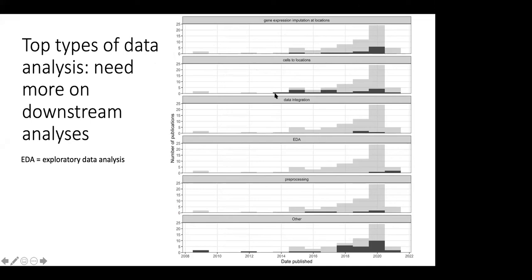Again, we see, consistent with the observations from how we're actually using the single-cell spatial technology, that the most popular ones are actually designed for integrating the spatial data with single-cell RNA-seq data. In some ways those are complementary. But besides those, there are also more and more packages for exploratory data analysis, such as Giotto and ST Utility, which is for ST data, and Seurat also does that, and then also image preprocessing.